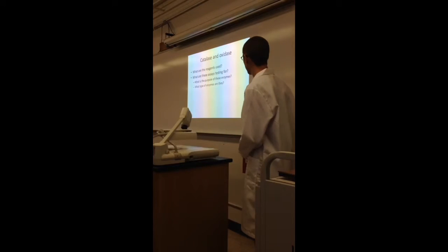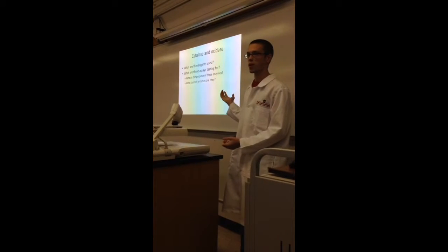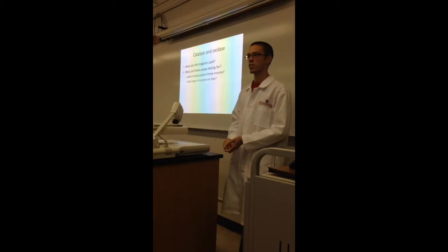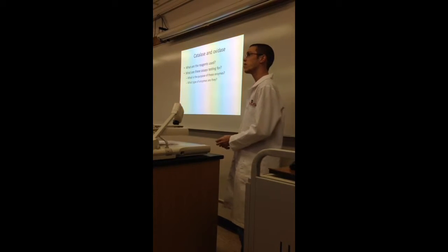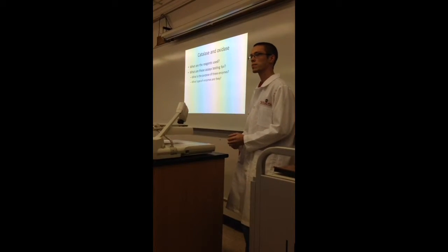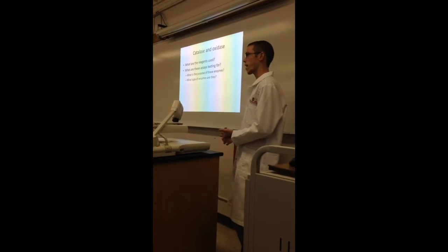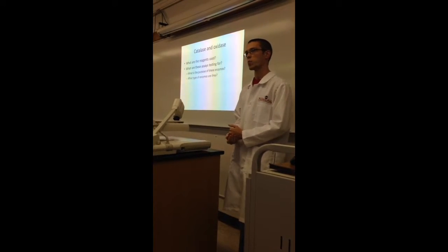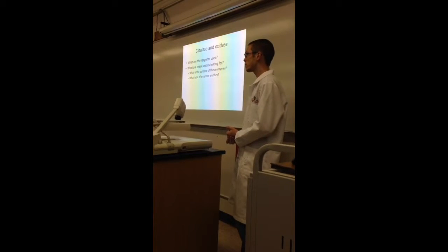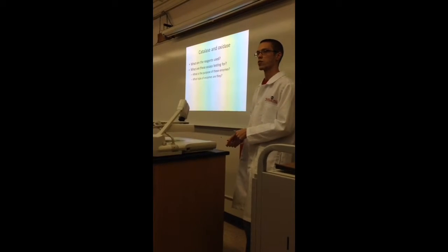And what are they testing for? What are catalase and oxidase testing for? I'm not really looking for catalase and oxidase, that's fairly obvious, but what's the purpose of the enzyme? What do catalase and oxidase do? What purpose do they serve for the cell? If you think about the actual enzymatic reaction for catalase, does anyone remember what that is? That should be a big clue as to what the enzymes do. Okay, so catalase converts hydrogen peroxide to water and oxygen.